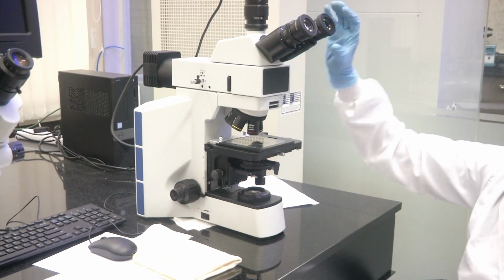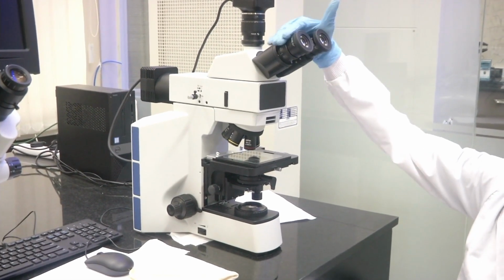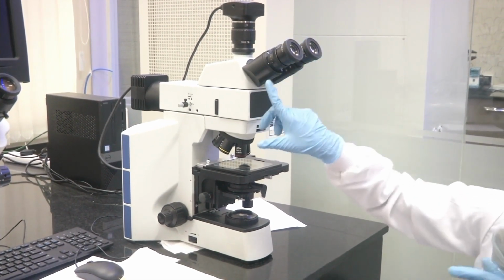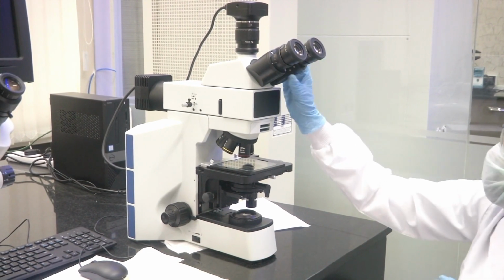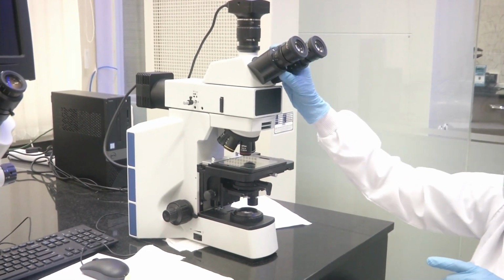So, the eyepiece is where you see the samples. The eyepiece provides 10x magnification, usually most of the time. If you look at what is written on the side, you might not be able to see it, but this has 10x magnification.